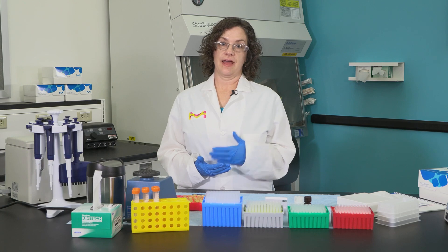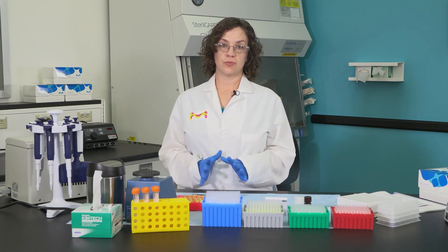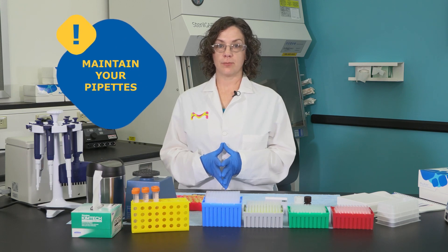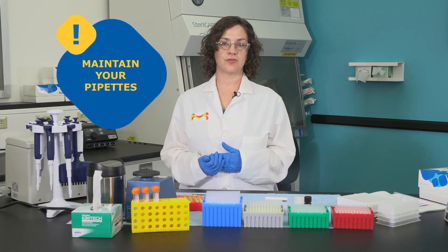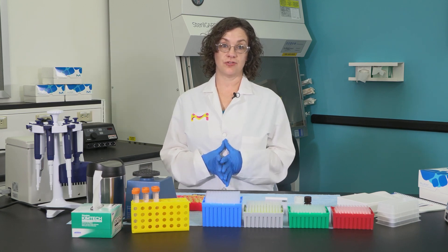A proper and consistent pipetting technique is key to accurate data, especially if multiple users will be generating data in collaboration. Maintaining properly calibrated pipettes is important, and training on best practices for pipetting can substantially increase pipetting precision.